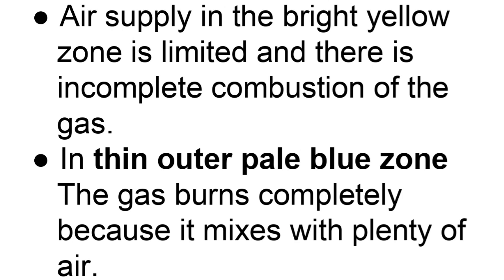This zone consists of gas which mixes with plenty of air and it burns completely. The laboratory gas mixes with plenty of air and there is complete combustion, and therefore the pale blue zone.